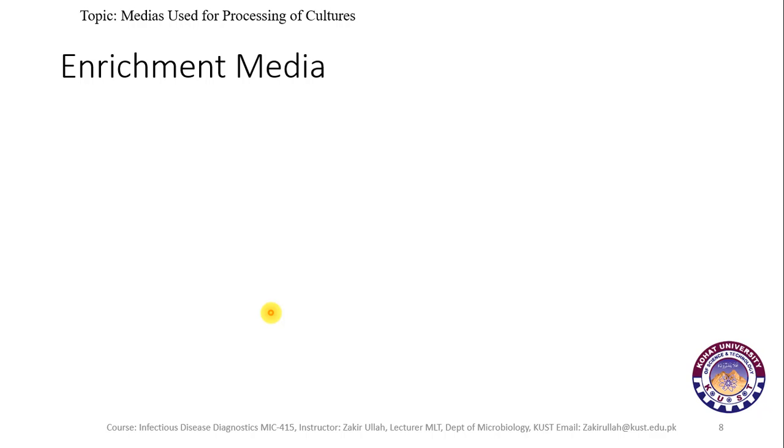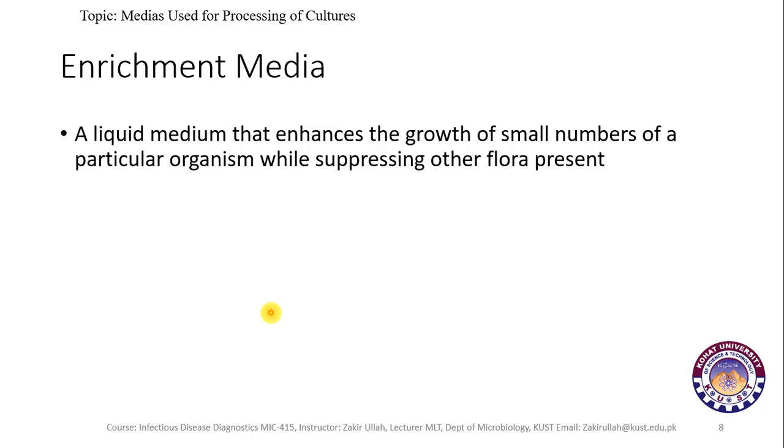Enrichment medium. This is a type of medium, usually a liquid, which enhances the growth of small numbers of specific organisms and suppresses the other normal flora.